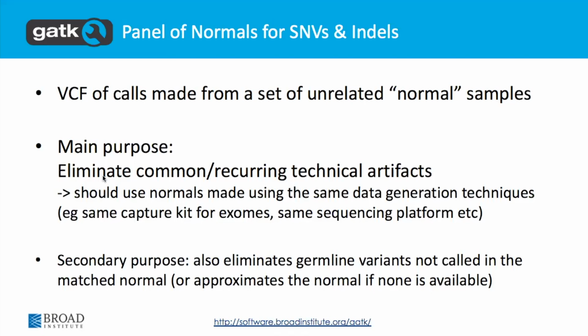The nice thing about the somatic calling model is that it's agnostic of ploidy. It basically decides, since I don't have a reasonable assumption of what it could be, I'll take whatever comes in. It'd be interesting to actually test this out, but I think that should be fine, because the model is pretty much, give me whatever you have.